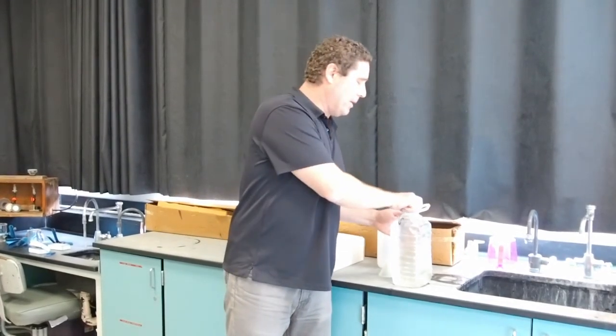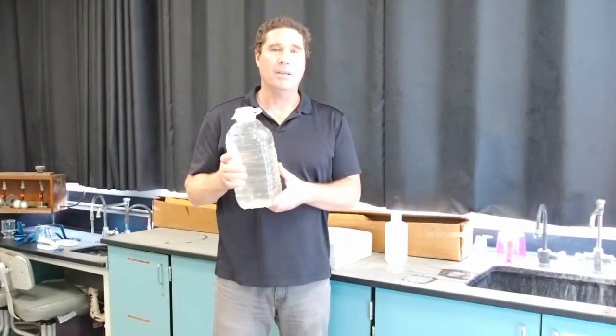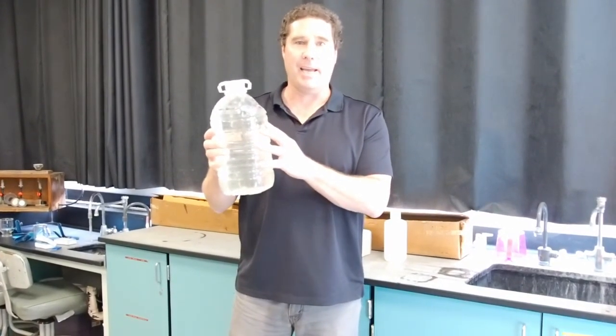this module we're going to be talking even more about the factors that control primary productivity and how productive phytoplankton are as the base of the food web. Right now, the lab is about how we actually go out and quantify how much phytoplankton are in the water, and we do that by quantifying the amount of chlorophyll that we find in the seawater. Phytoplankton have to have chlorophyll to do photosynthesis, so it's a great proxy for the relative abundance of phytoplankton algae in the water. So here's a sample that Carl collected from Mission Bay.